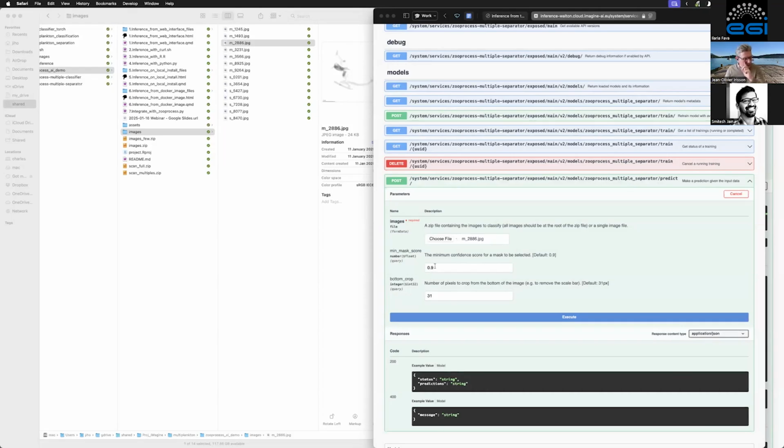And then the separator, it starts by trying to identify which portions of the image are separate objects. And so it proposes masks, and there's a threshold of the probability of these masks being correct. The lower you put it, the more different masks it would accept. The higher you put it, the more stringent it is to make sure that it identifies something it's really confident about. The default is 0.9 because we'd rather be confident than having extra lines everywhere, okay? But you could experiment with it.